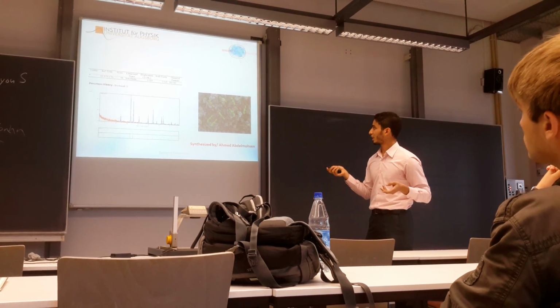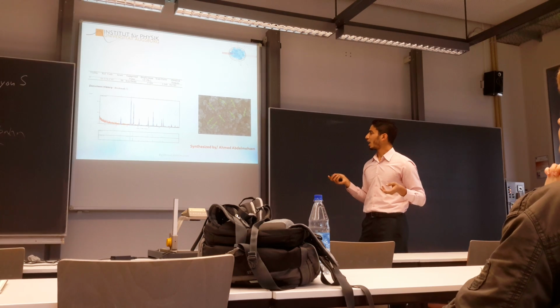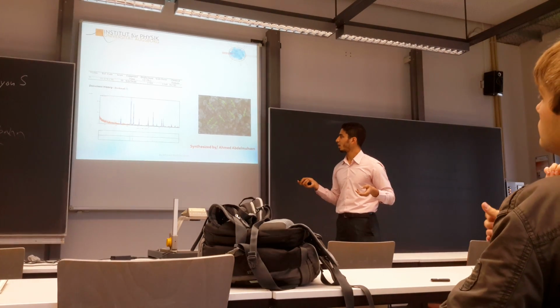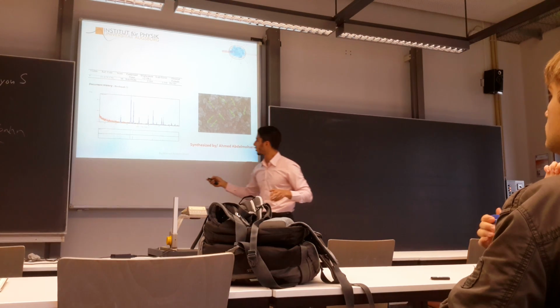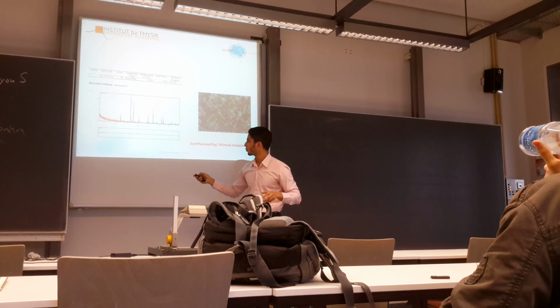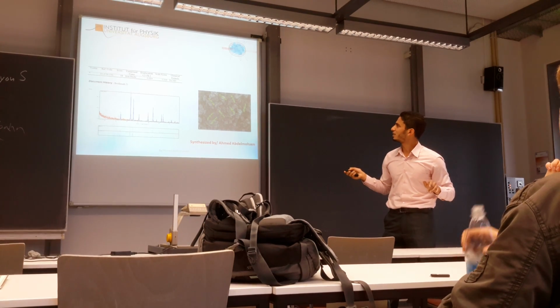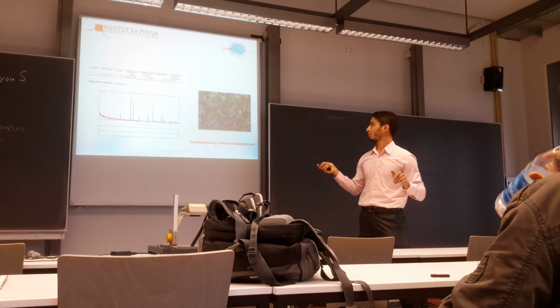As soon as you do characterization, you get these peaks from your apparatus. So now you are searching for matching. This appears first, and then you try to match this one with that one. So you try 1, 2, 3, 4 until you get complete matching. This high intensity with this one, this with this one, and here. If you can do matching 100%, it's okay, it will be so fine. But now we have 90, 80%. It's very good. And you get here the number of the cards I mentioned before.